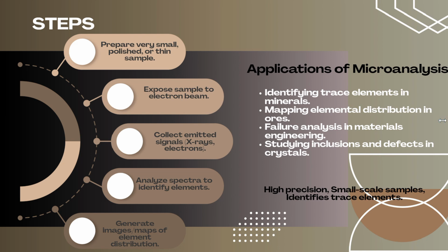So again, the instrumental methods of analysis are spectrophotometry, X-ray diffraction or XRD, and XRF or X-ray fluorescence. Then lastly is microanalysis.